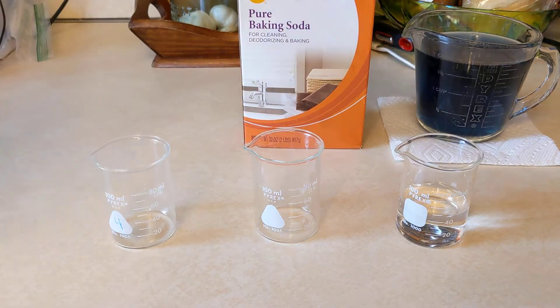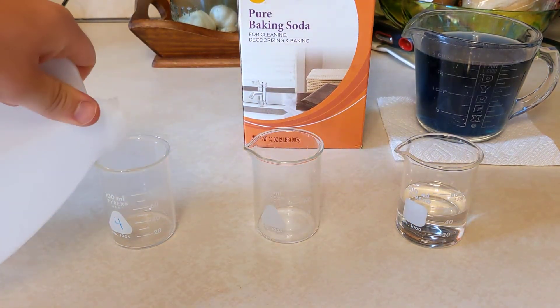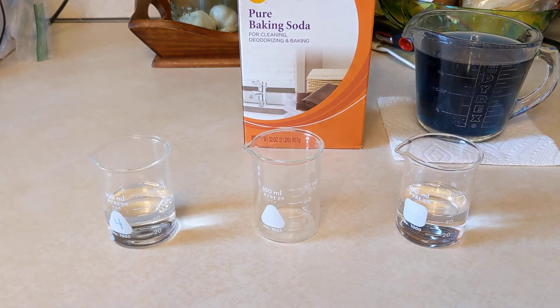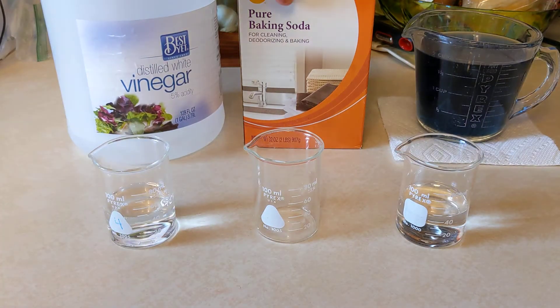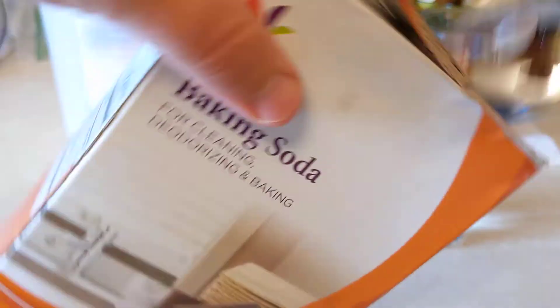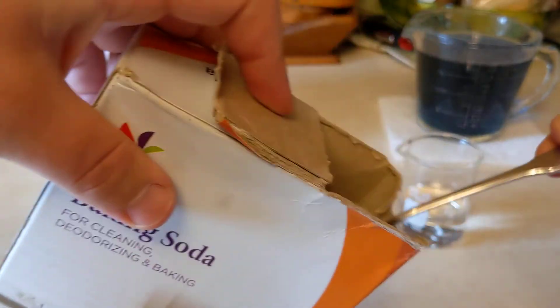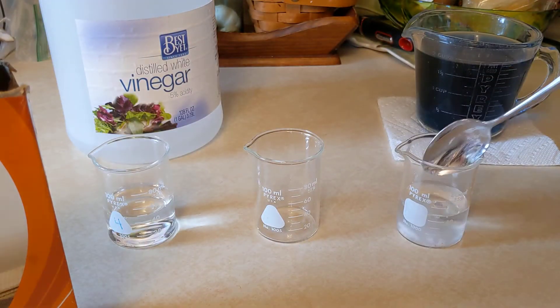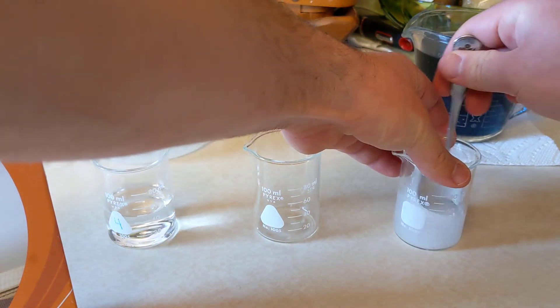I have distilled white vinegar here, so I'm going to measure out a little bit of that. And then here I have just ordinary water, so I'm going to take the baking soda and add a little bit of baking soda to that and mix it all up.